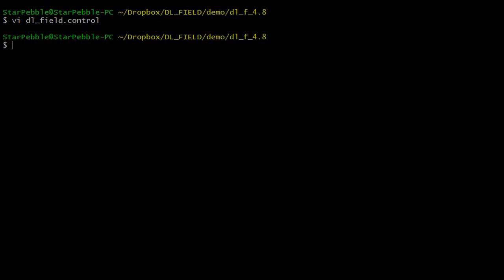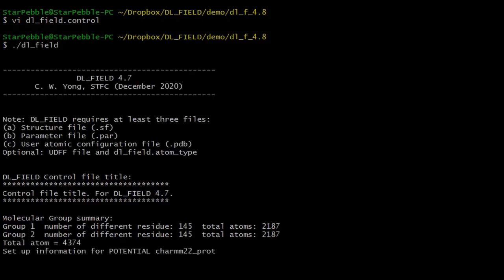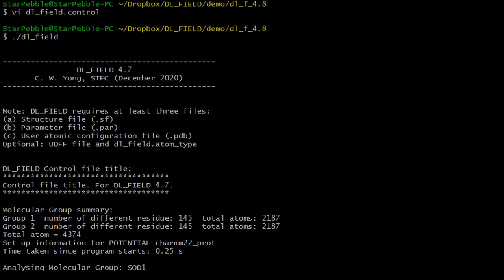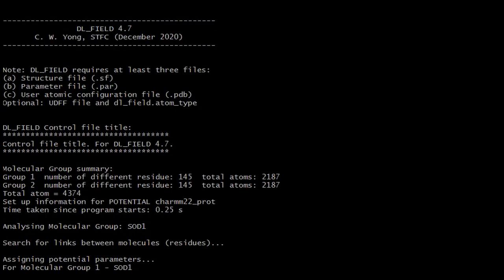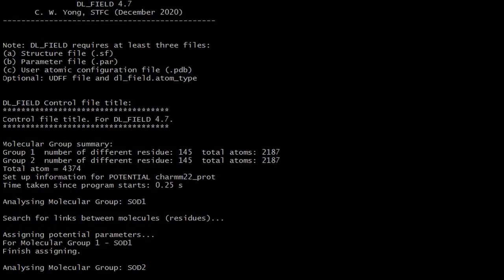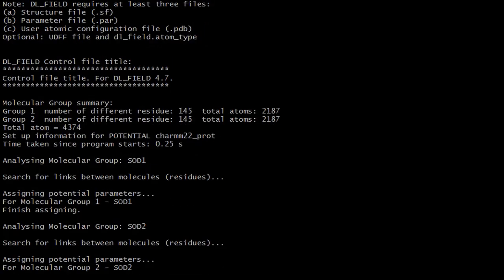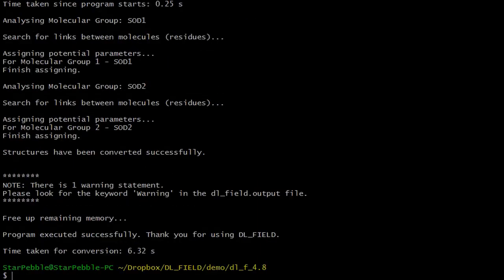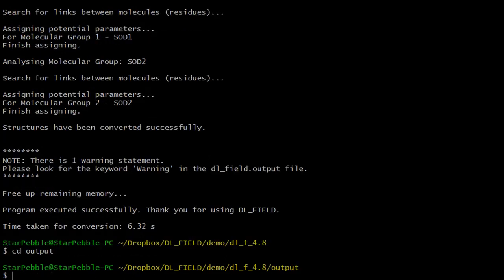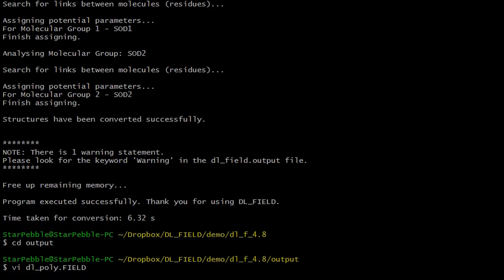Now let's run DLFU. You will notice DLFU set up two molecular groups SOD1 and SOD2. This is also shown in the field file.